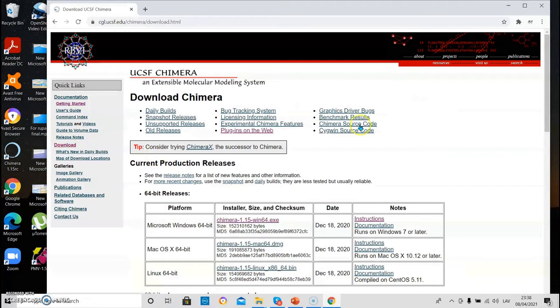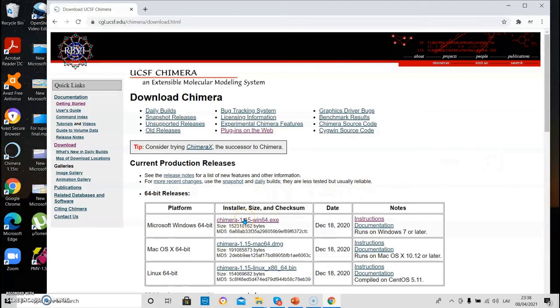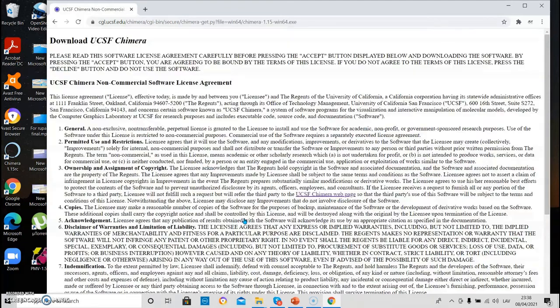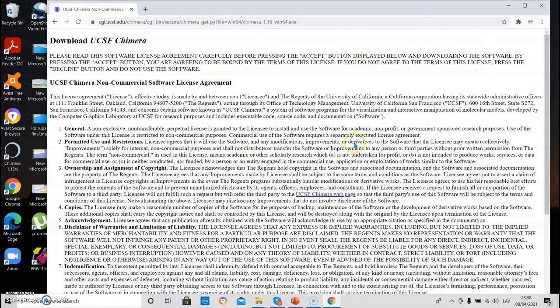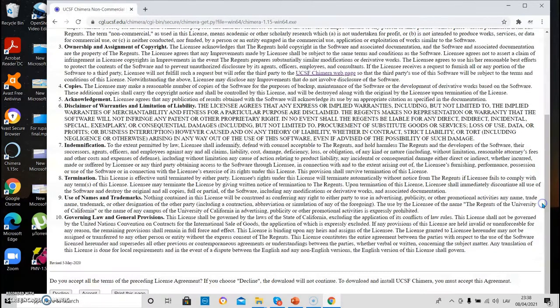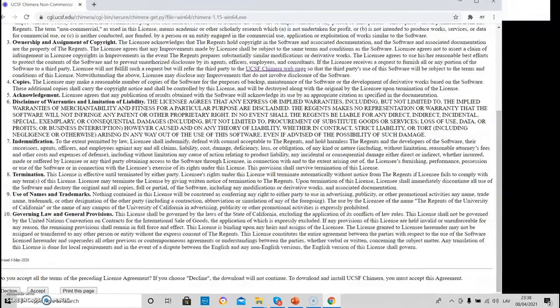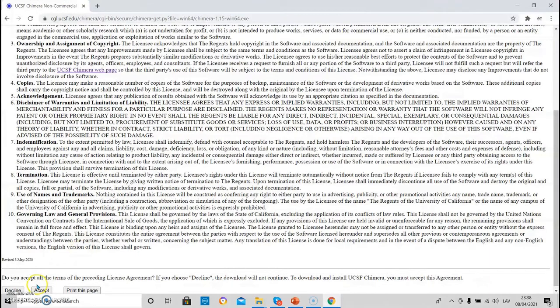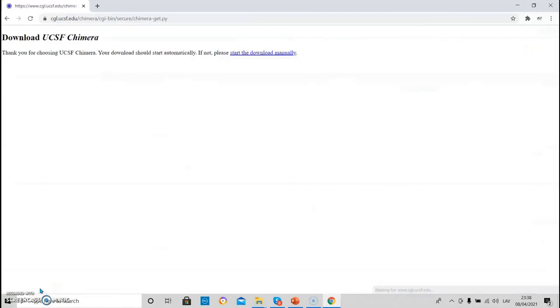Once you are on the download page, go here and click on the Windows installer. This is the license, you have to scroll down and then click accept. The download will start shortly.